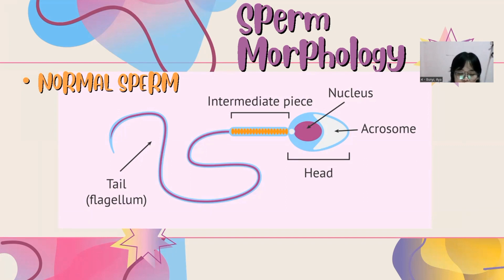The tail piece should be 45 micrometers long according to Strassinger and 50 to 55 micrometers in length according to the graphs, and varies in thickness from 1 to 0.01 micrometer from neck to tip. The neck piece attaches the head to the tail and the midpiece. The midpiece should be 7.0 micrometers long and is the thickest part of the tail because it is surrounded by a mitochondrial sheath that produces the energy required by the tail for motility.